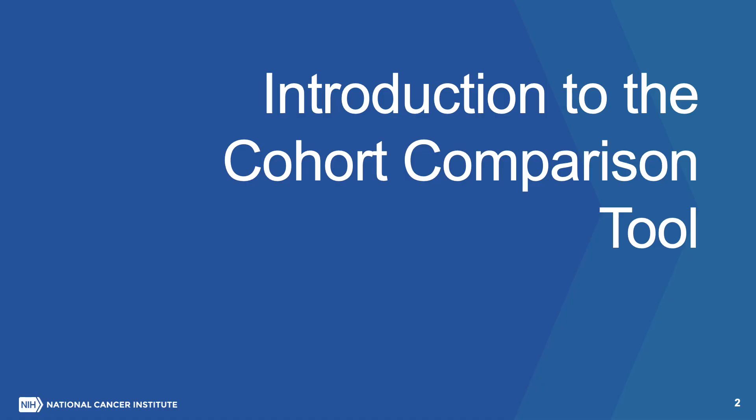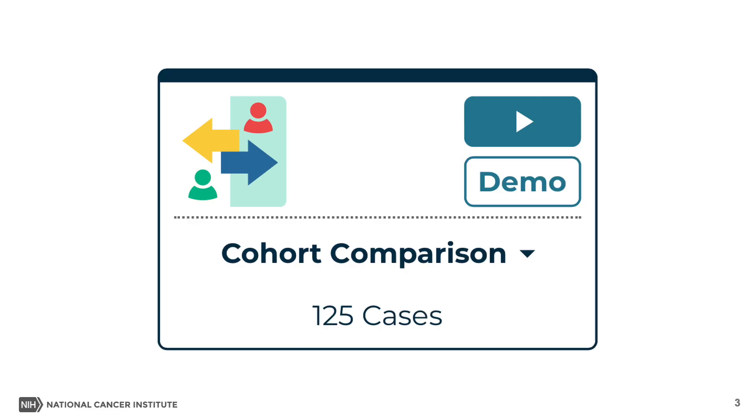Introduction to the Cohort Comparison Tool. The GDC's Cohort Comparison Tool generates a series of graphs and tables that compare and contrast two cohorts. In this video, we will use the Cohort Comparison Tool to create survival plots, Venn diagrams, and bar plots that visualize the similarities and differences between the active cohort and a different saved cohort.